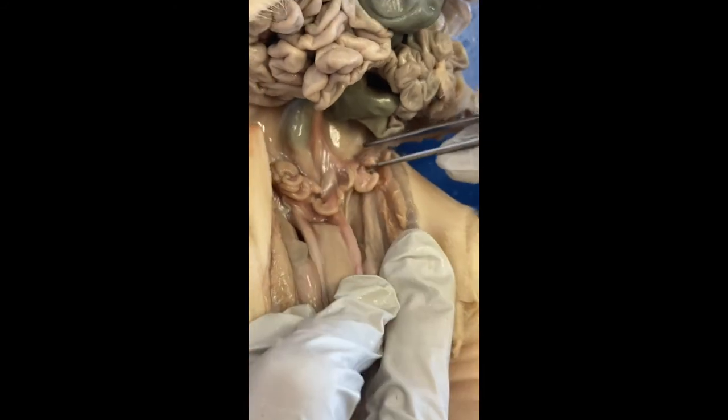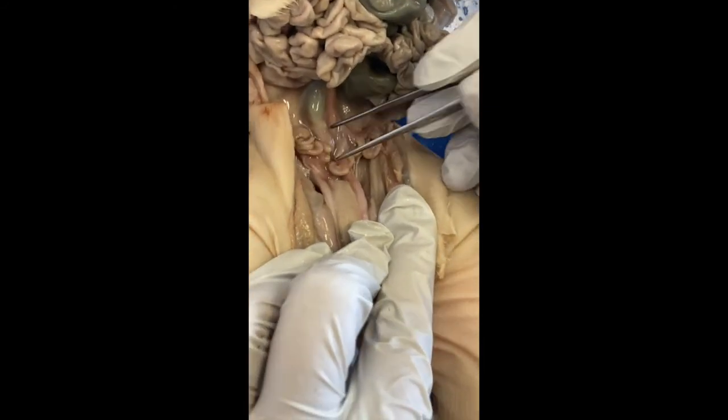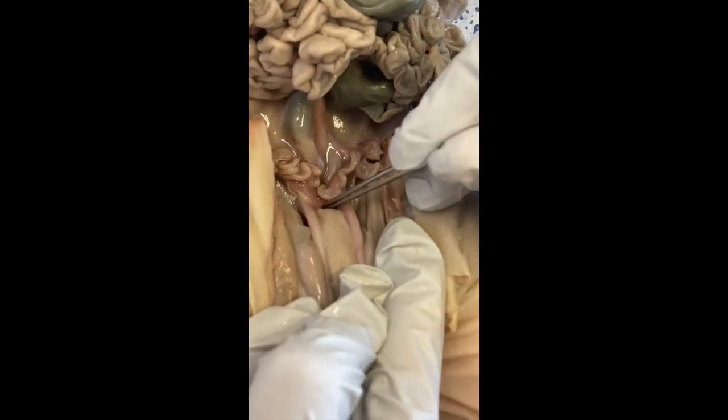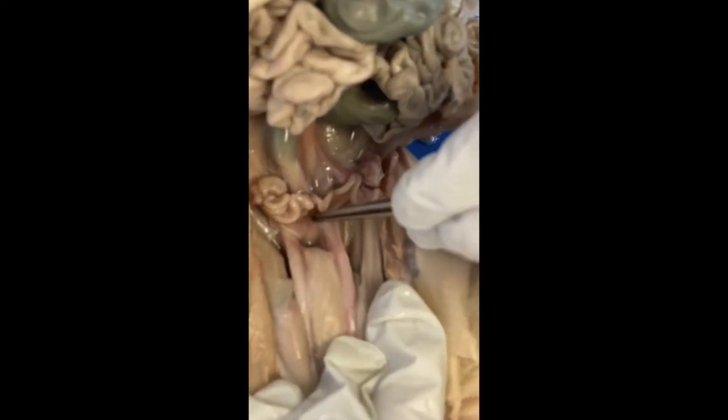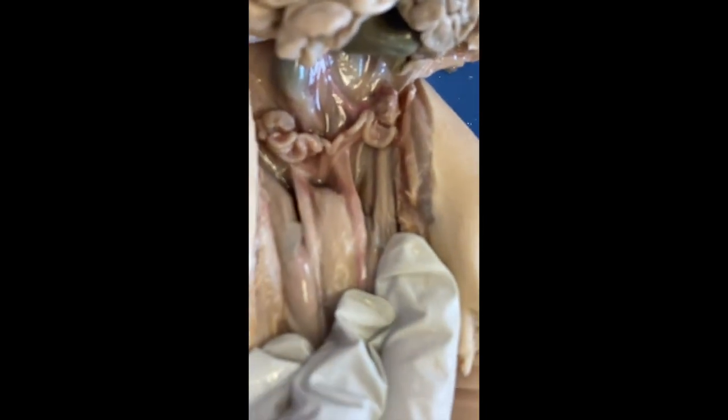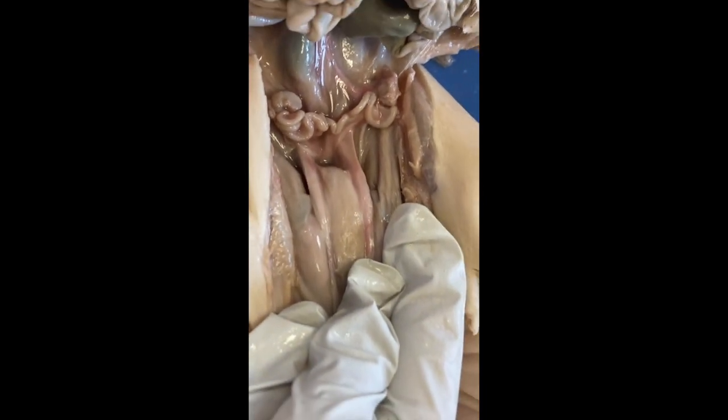So the only thing you need to know here for the female is oviducts on each side leading to an ovary on each side. And right here, which is what you would expect, this area would be the uterus. And that wraps up the female reproductive system. The male did not have that.